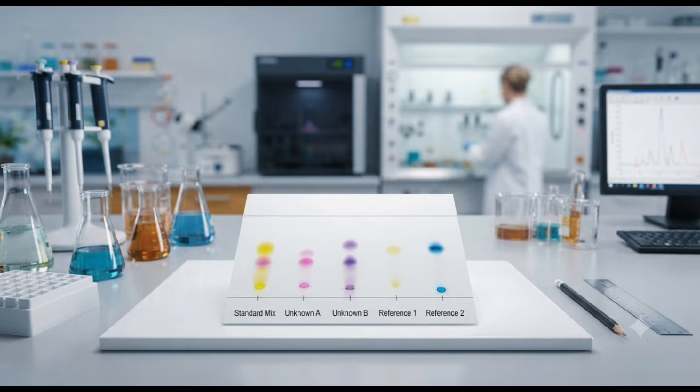In summary, thin layer chromatography is a simple, fast, and effective technique for separating and evaluating components of a mixture. By understanding the stationary phase, mobile phase, migration behavior, visualization, and RF value, TLC can be used effectively for qualitative analysis and laboratory investigations.